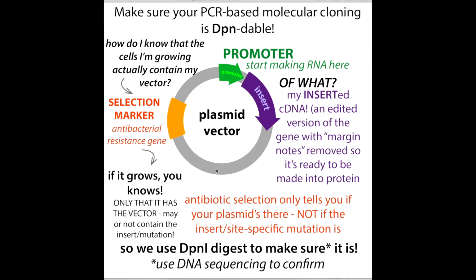When you're doing restriction cloning, normally you purify the vector DNA, and you purify the insert using gel purification. So basically you run an agarose gel to separate them by size, and then you extract it out of the gel. So you shouldn't have any parent plasmid in there, because you should have only had the cut version be purified, but it can still happen.